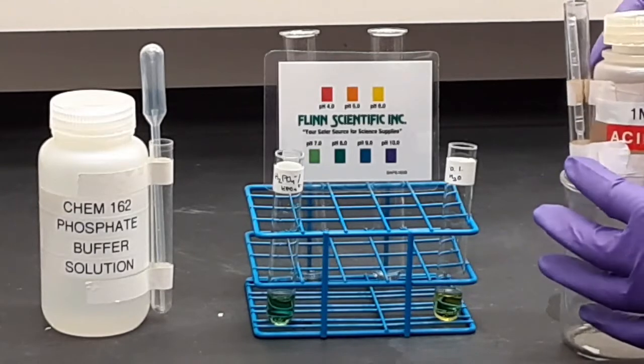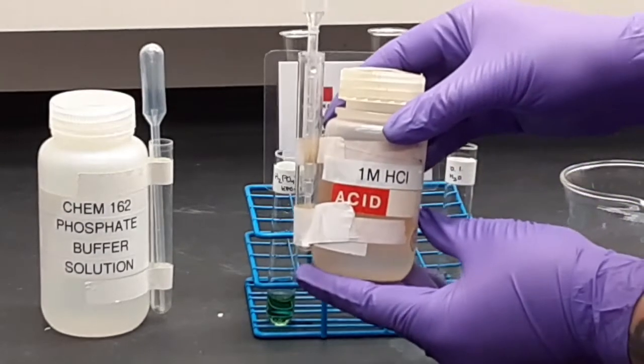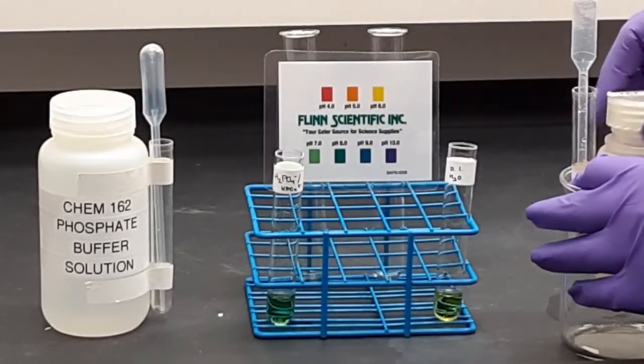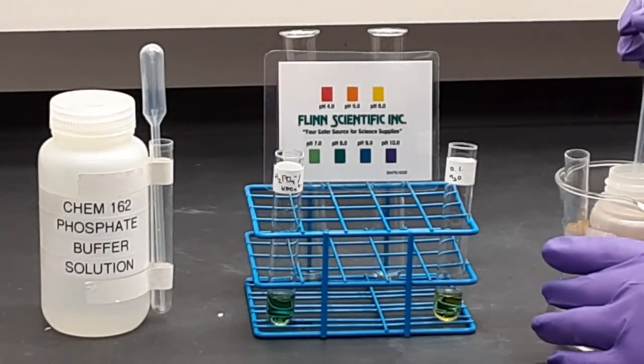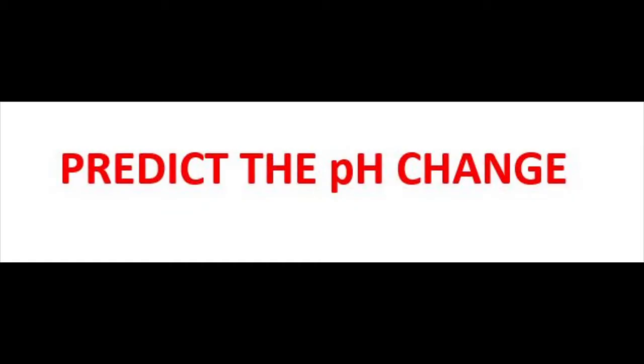So now Heather is going to add the 1 molar hydrochloric acid to this solution. Or I should say to these two test tubes. So predict the change.